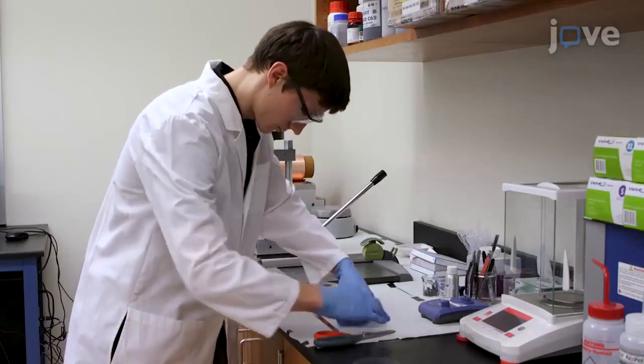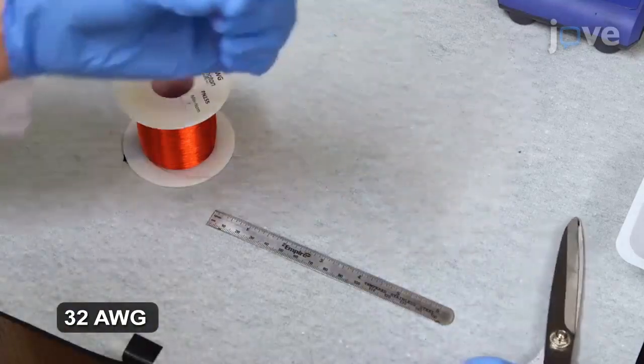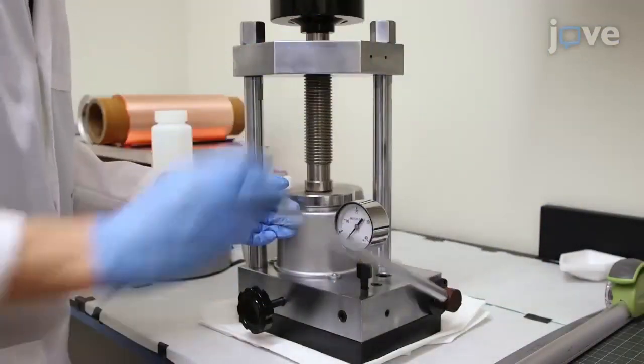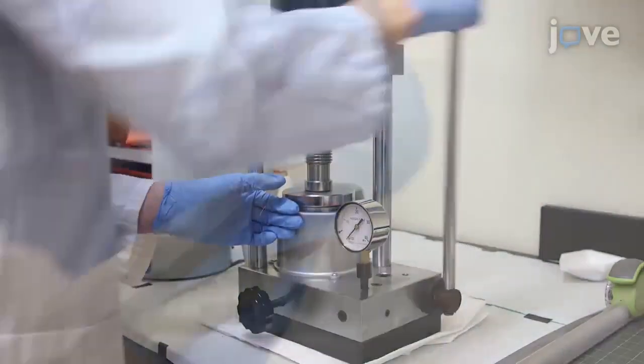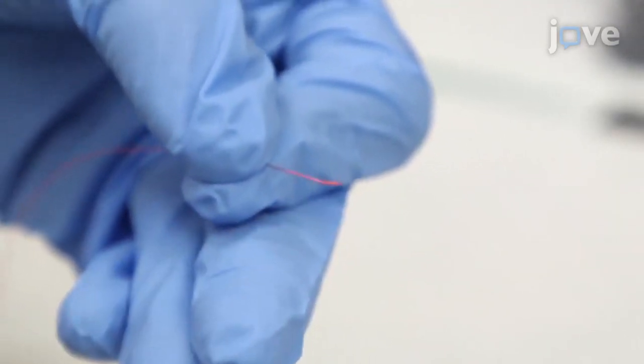Construct the reference electrode with enameled copper wire. Cut a 120 mm length wire for each 3-electrode cell. Place one end of the wire about 10 mm into a lab press and apply 4 MPa of pressure. After removing the wire, cut it so the flattened section is about 2 mm long.